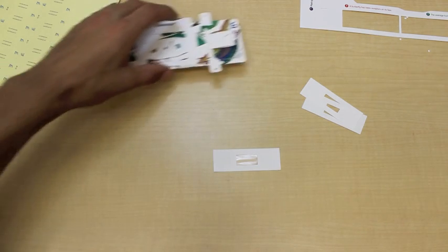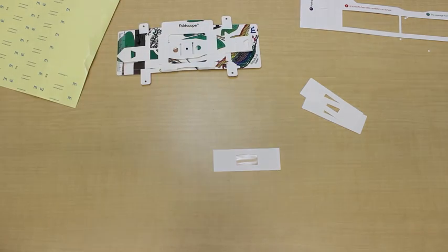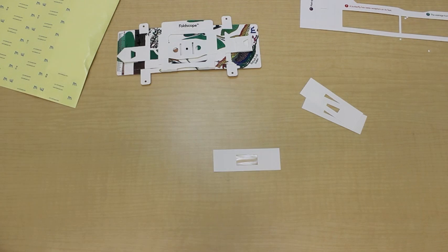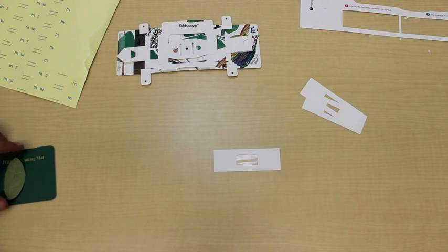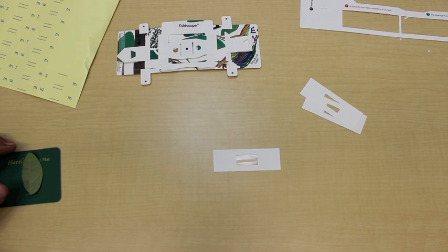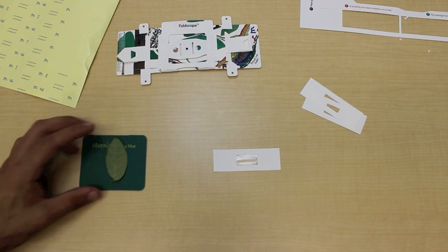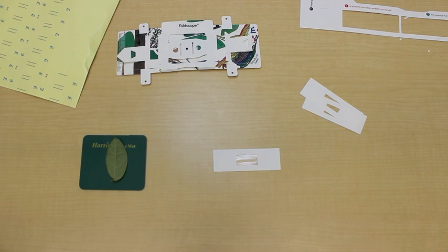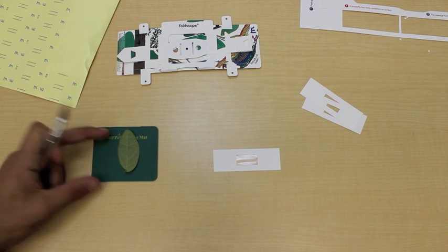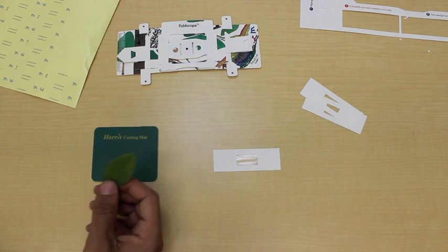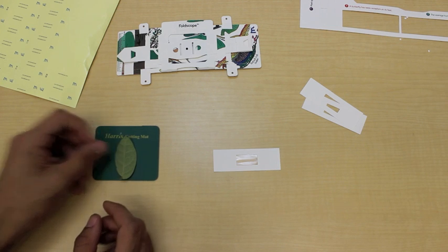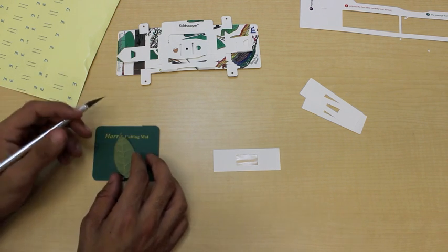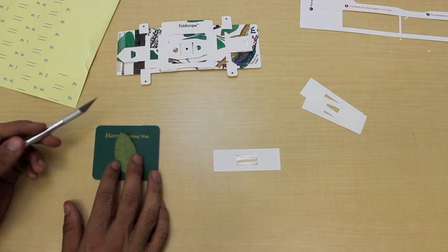Now we need to place a sample on this. In this step, we're going to be preparing a dry sample. Dry samples can be anything from blades of grass to strands of hair to insects or anything that isn't liquid. I've chosen to prepare a leaf. The leaf itself is too thick to see under the microscope, so we need to cut a thin strip or a thin piece so that light will be able to pass through it.